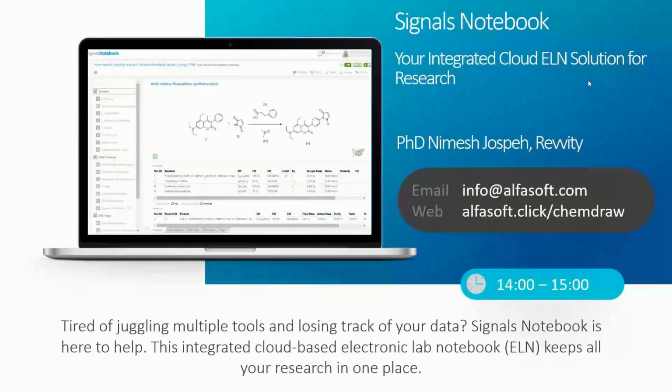Once the CRO users complete the work order, they deliver their results in associated experiments right within the Signals platform. So this is seamlessly the same platform. You don't have to jump into another platform. Results can be delivered within the experiment via a variety of flexible formats such as an Excel file, CSV, or other file upload, or data entry into the templated structured table itself.